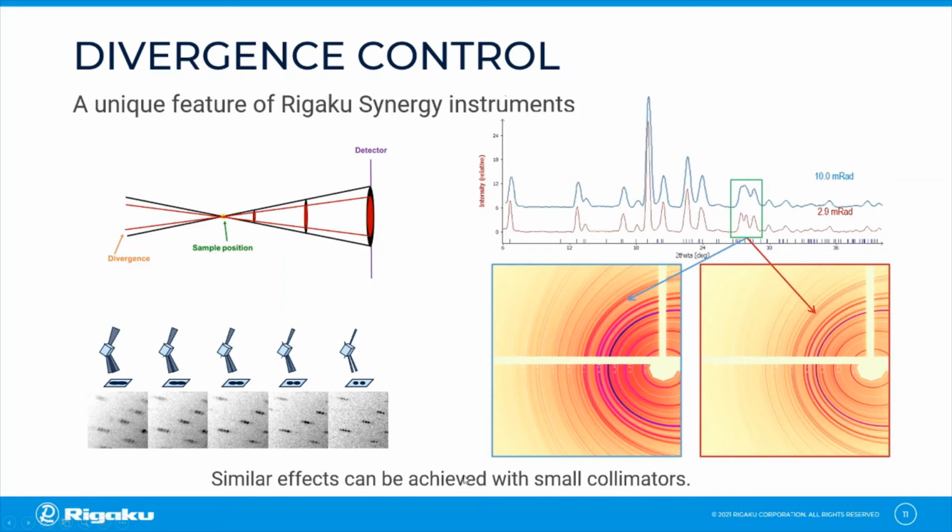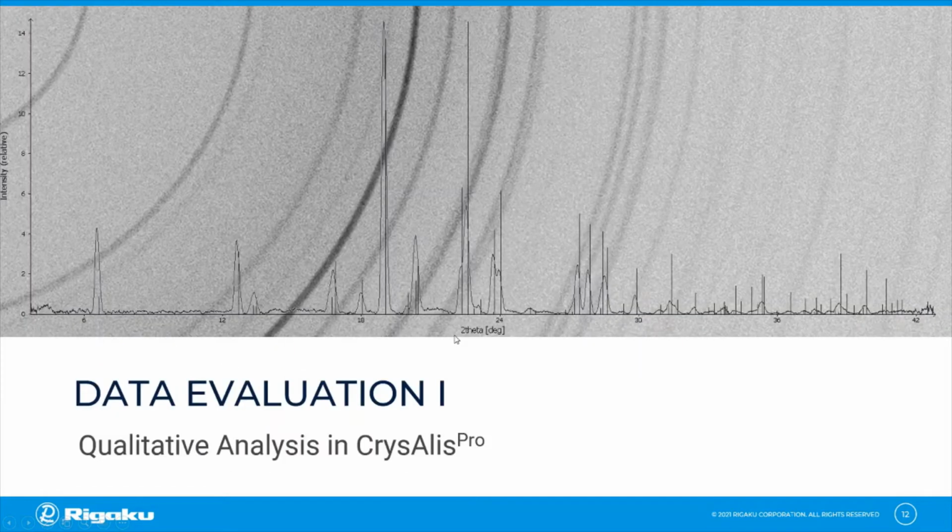Similar effects can be achieved with very small collimators if you have these available. After the data collection, I want to quickly address the possibilities of powder data analysis. And, as a first step, I want to go back to CrysAlisPro.